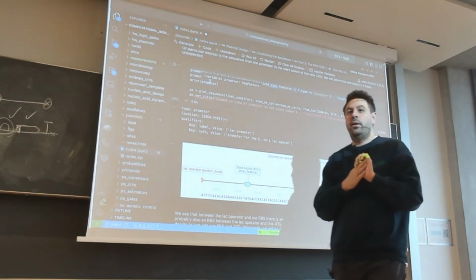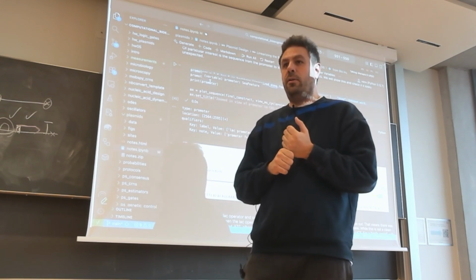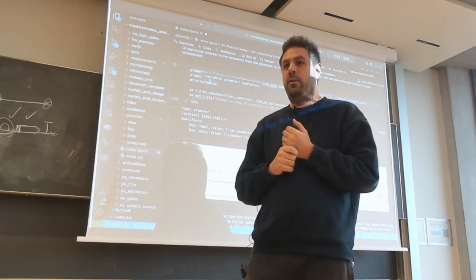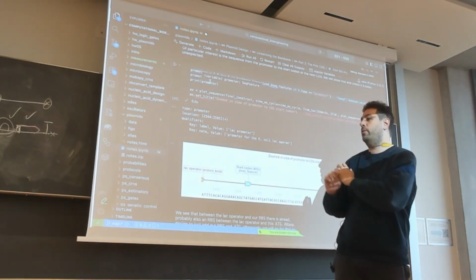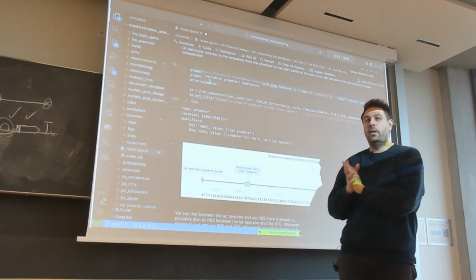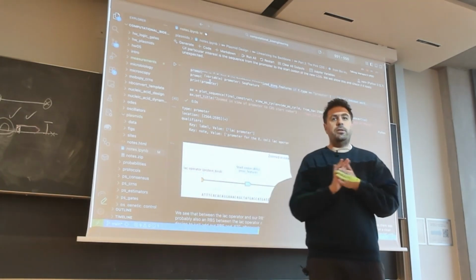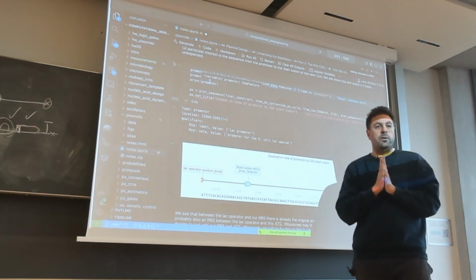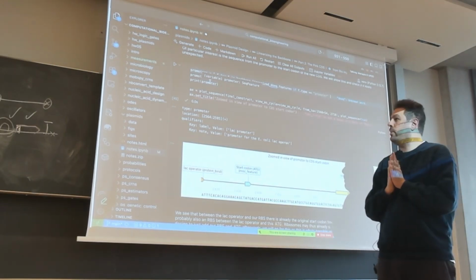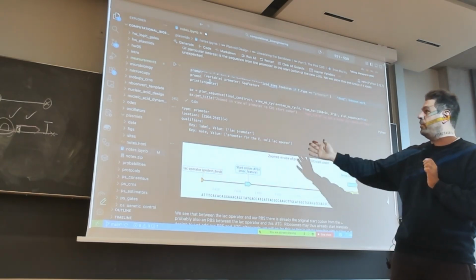There is a question online. What do you recommend? Python-based cloning simulation like this, or software like Benchling or Snapgene? Okay, I have a strong preference, and in the spirit of this lecture I would really use Python-based. I know that Snapgene and Benchling have that, and they are doing a great job, so I don't want to say bad things about them. But the really nice thing is that everything here is coded.